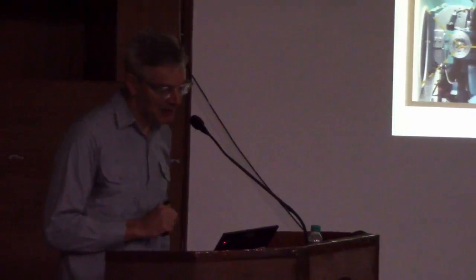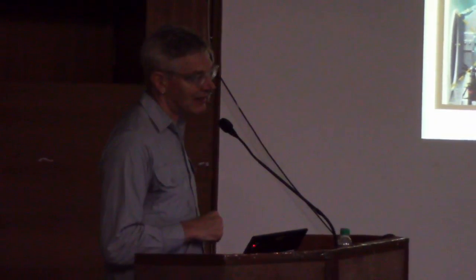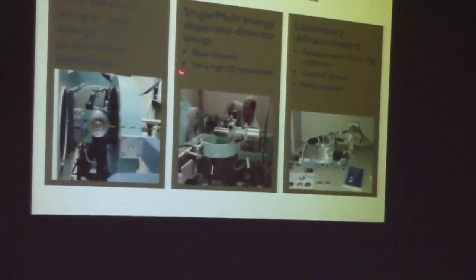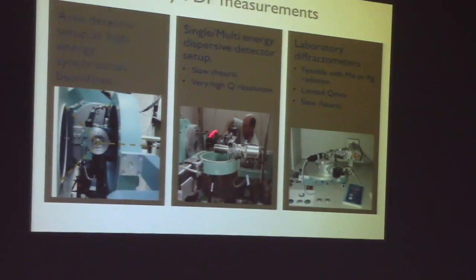So this method of collecting data is extremely slow. It takes many hours to collect a data set, even at the synchrotron. But it does give you very high Q resolution. So if you need high Q max and high Q resolution, you can do it this way.